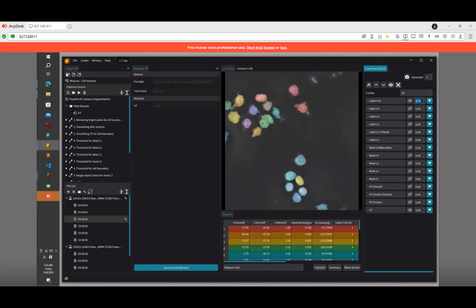With that feature, you can load this label mask image into the editor, divide the cells manually, and use the edited mask to get the result again. In that way, you can refine the results.